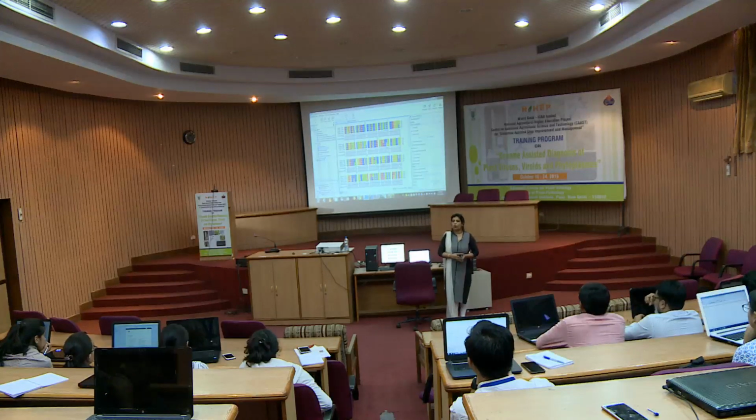Okay. Now, should I move further, or do you have any query? You can point it out right now, otherwise you will get confused.